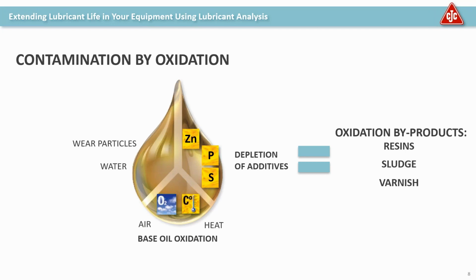Yeah, I completely agree. And one of the points that I like to make when we're relying just on ISO codes is that when you look at particle count, there are a couple different types of particle counting technology, and some of those look at only hard particles like metals and dirt. Some of them only look at soft contaminants like sludge, oxidation byproducts, water droplets, air droplets.